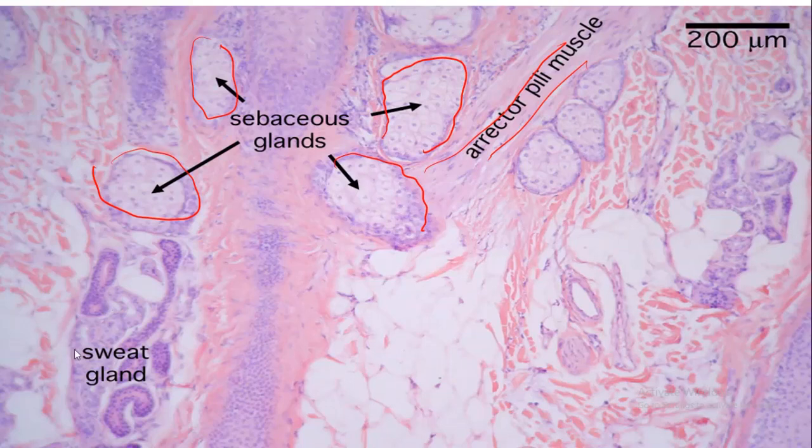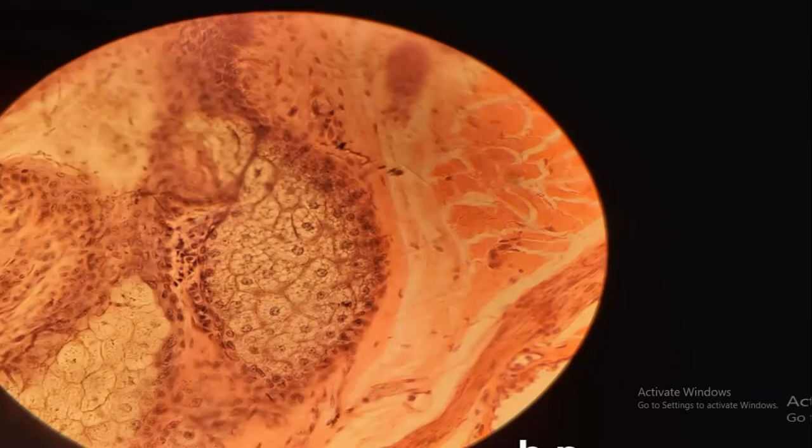Like I said, other content you can talk about are the sweat glands there. All these will be needed for you to be able to see and understand. Let me quickly go on to the next part. This slide is just the sebaceous gland, and I have fully explained the content, the parts, and the area of interest in practical number 2.